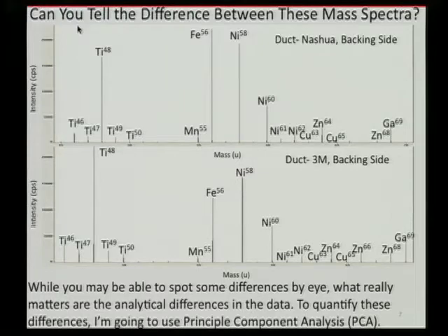So, can you tell the difference between these mass spectra? Well, you may be able to at least spot some differences by eye. What really matters are the analytical differences in the data. So to quantify these differences, I'm going to use principal component analysis, or PCA.